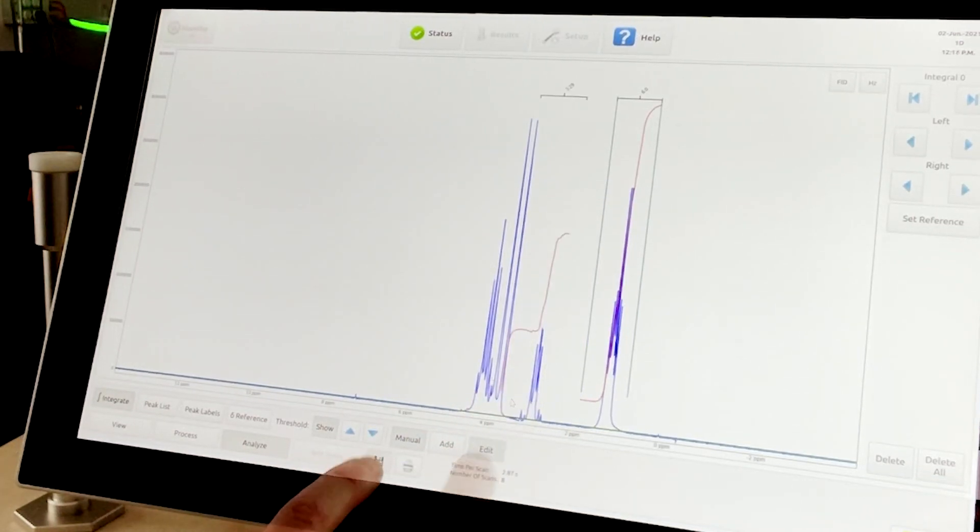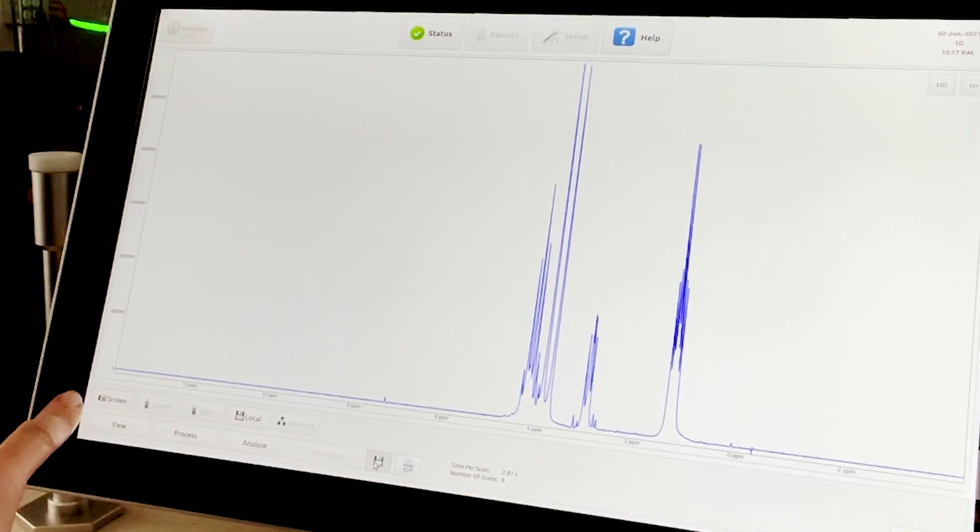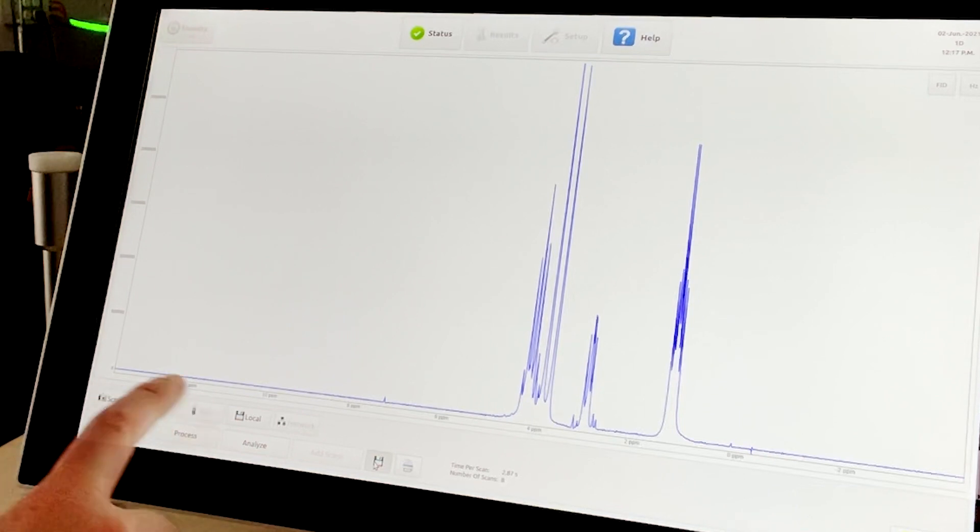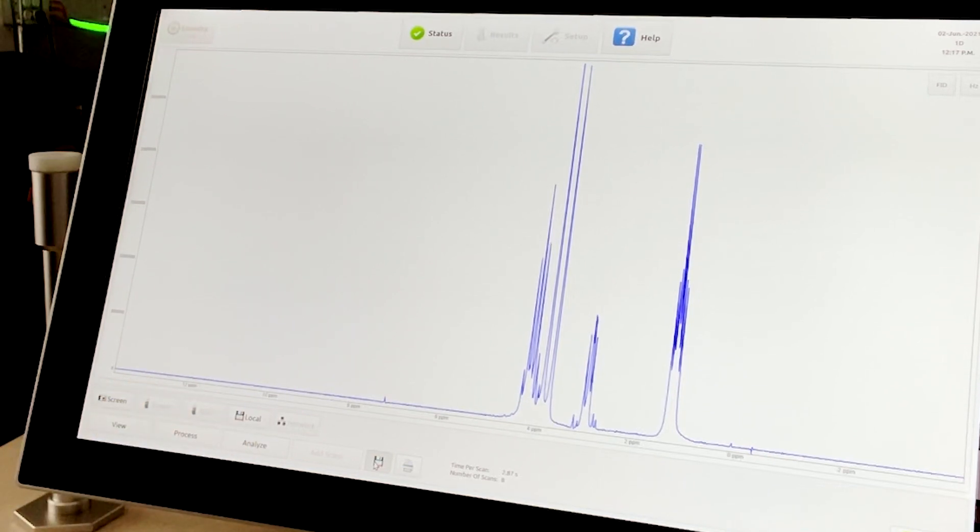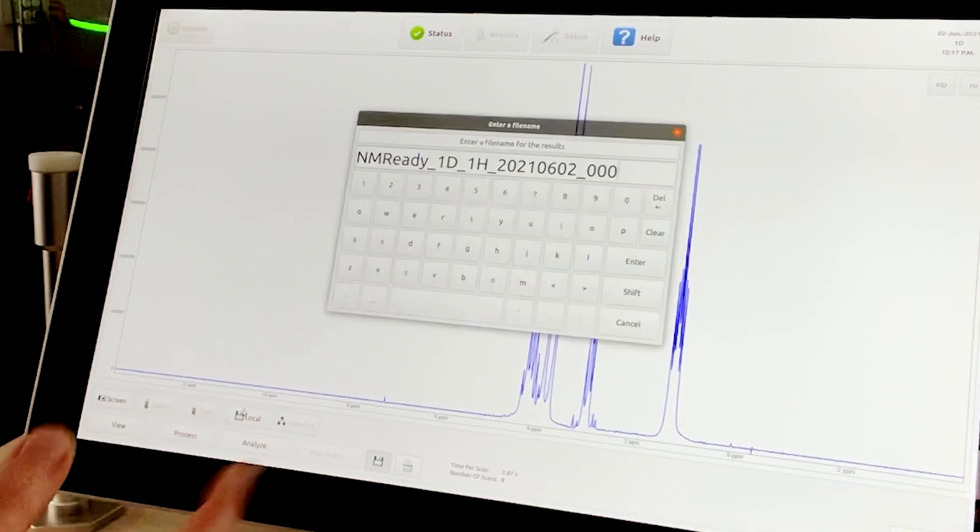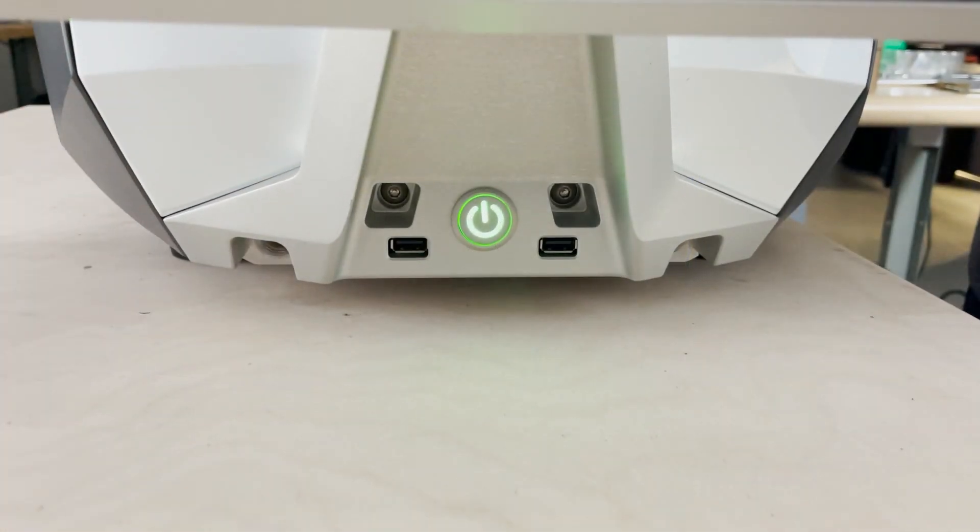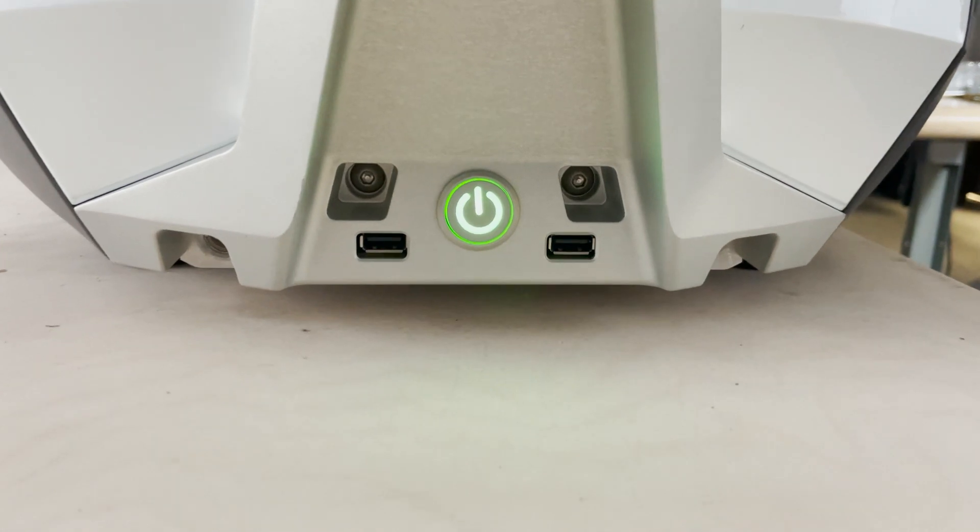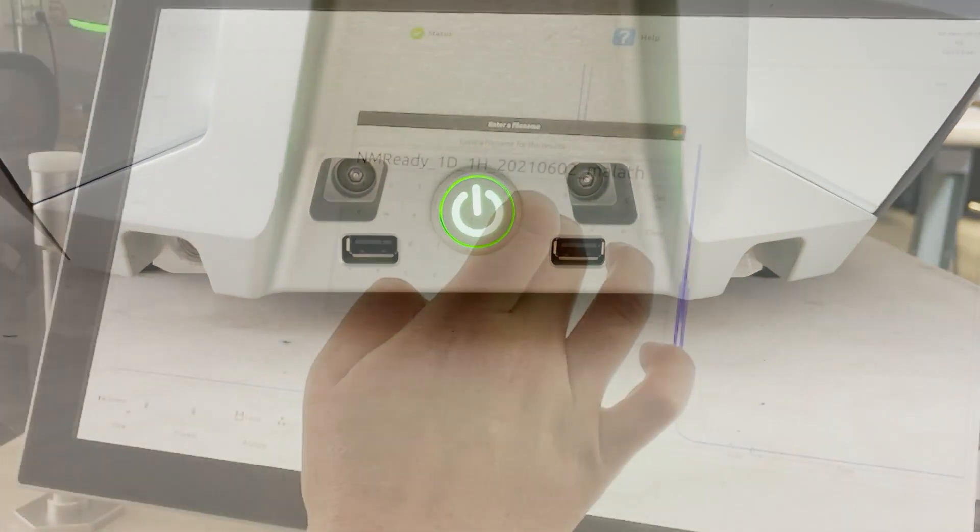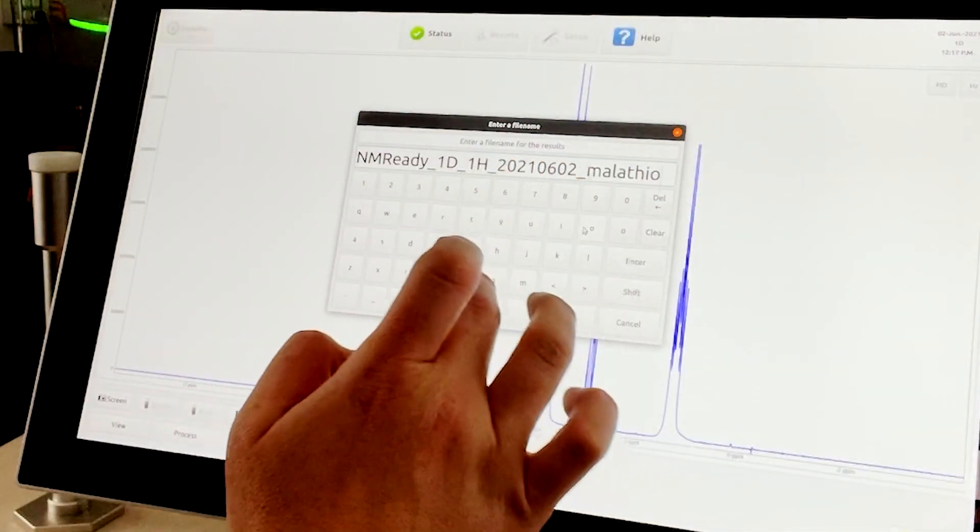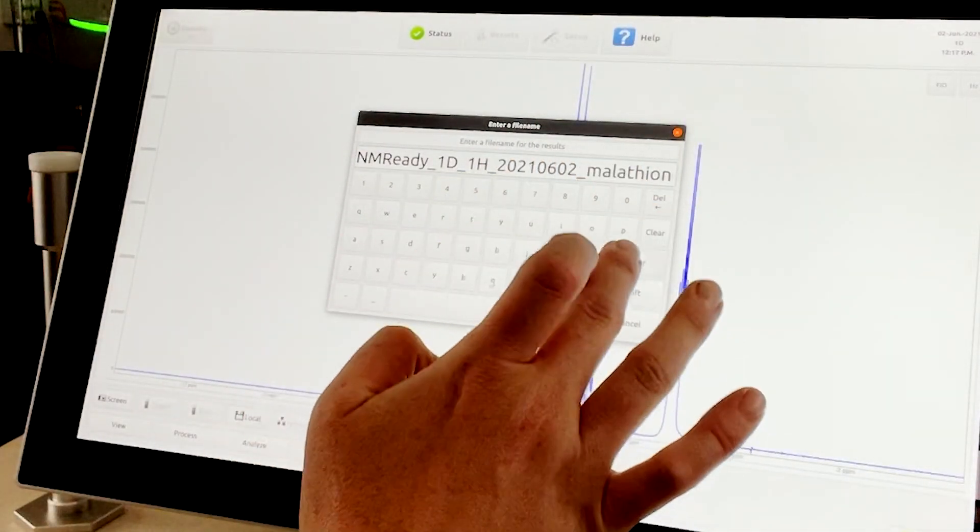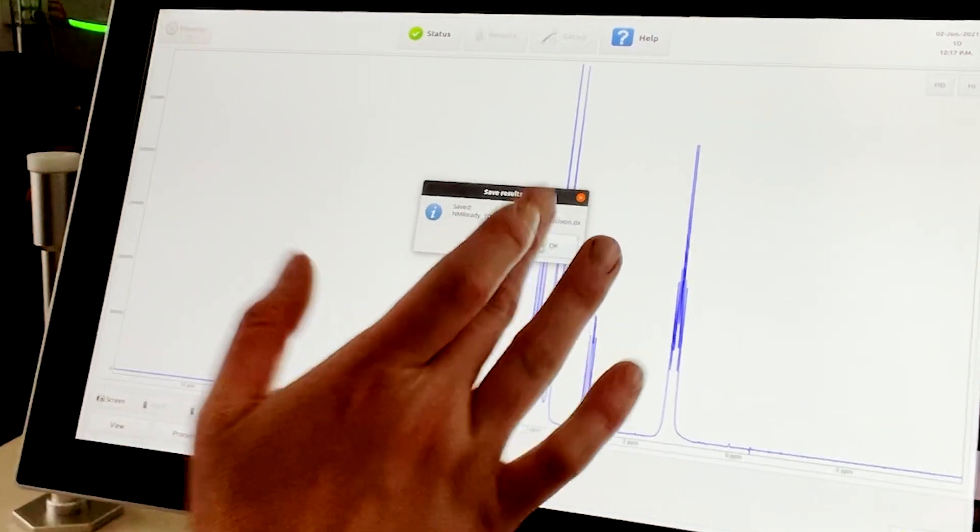Once the user is done, they can save the data as a screenshot, PDF, or JCAMP-DX file locally to the computer, to a network folder, or to a USB memory stick. There are two easy access USB ports at the front of the instrument. Once the desired location is selected, a keyboard will pop up and the name can be modified as desired.